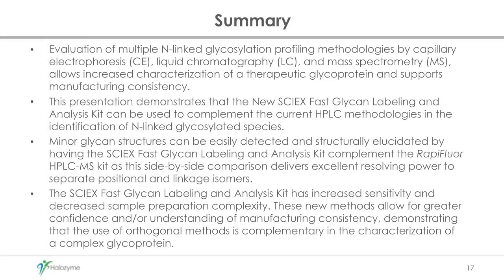So in summary, the evaluation of multiple N-linked glycosylation profile methodologies by CE and LC-MS allows increased characterization of therapeutic glycoproteins and supports manufacturing consistency. Anybody in biotech has to do this.